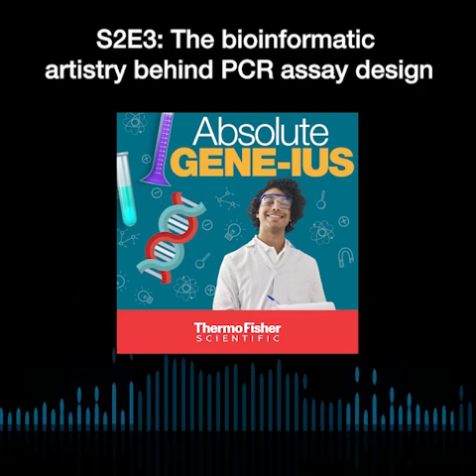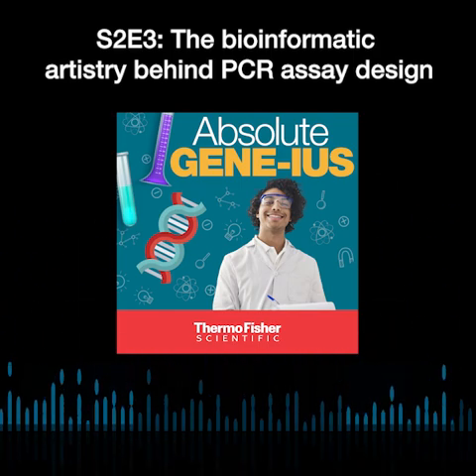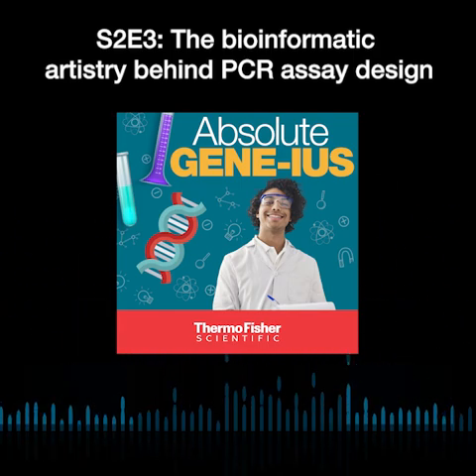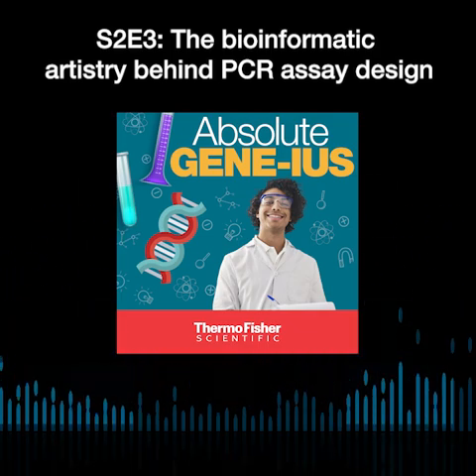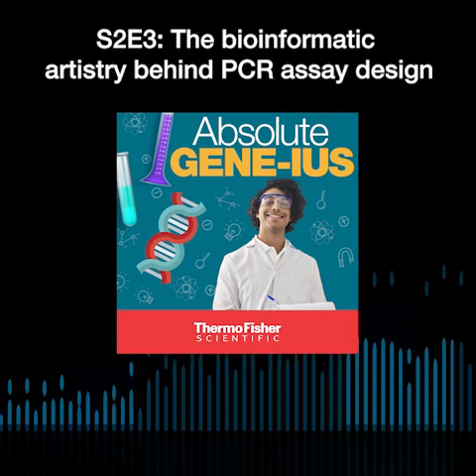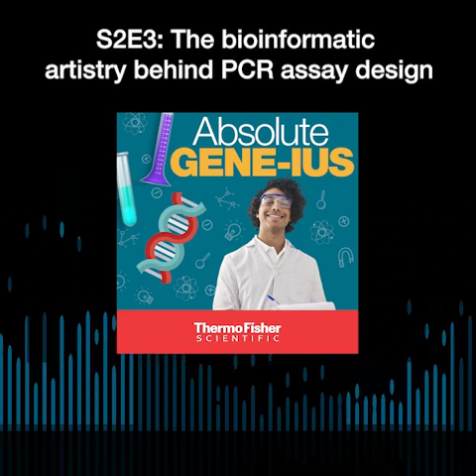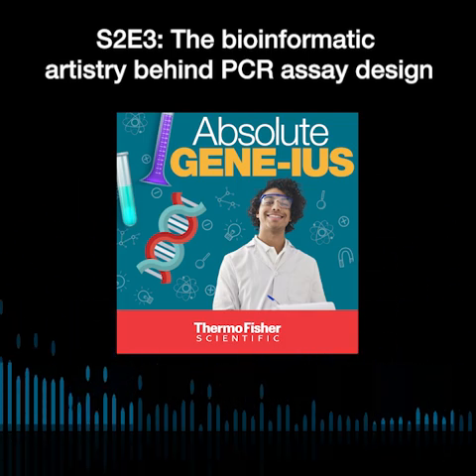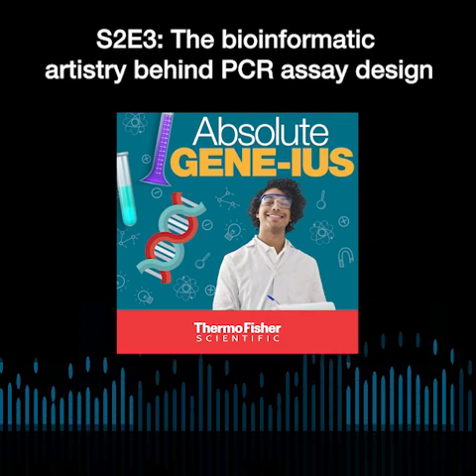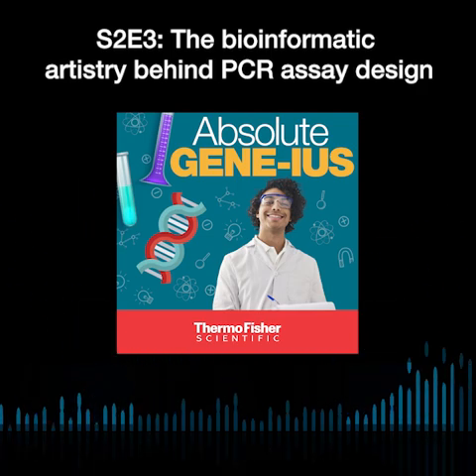So when you're designing your assay, always first think about what your control is. Digital PCR, one of its main strengths is rare target quantification, right? So a lot of times, when customers send us SNP requests, we would assume that it might be a somatic mutation target. So we started designing.